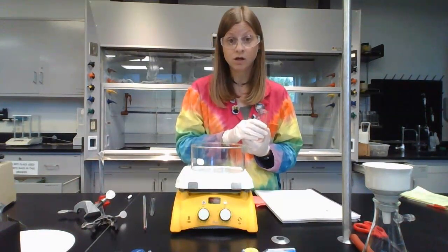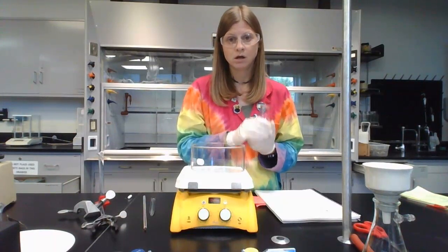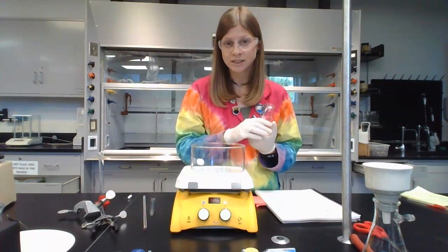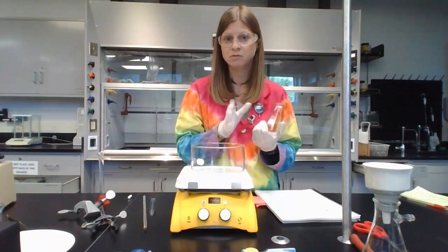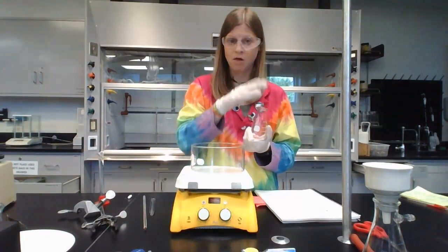It will be harmful. It will not feel good. We'll have to rinse your skin in the sink and potentially seek medical assistance afterwards. So just be very careful. That's why you're not pouring it. You're just going to drop, drop, drop, drop, drop, and then we're moving on.